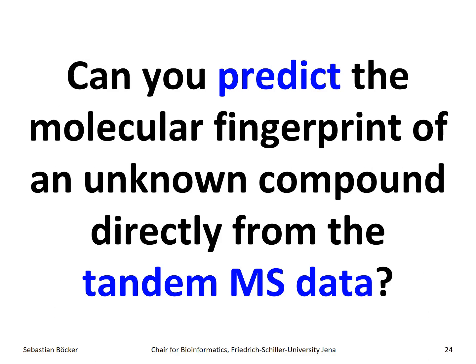And the question there is, can you predict the molecular fingerprint? So, all of the molecular properties of an unknown compound from the tandem MS data. So you have a query, you have measured the tandem MS, and you want to predict the molecular fingerprint. All of the molecular properties, 0 or 1.